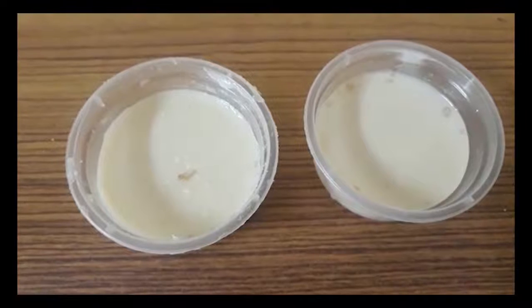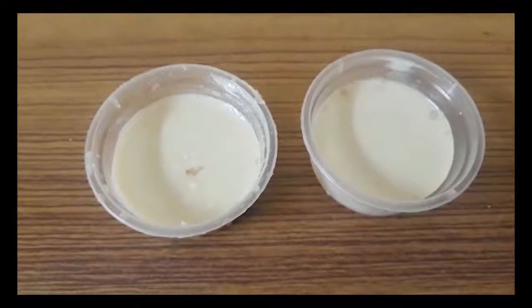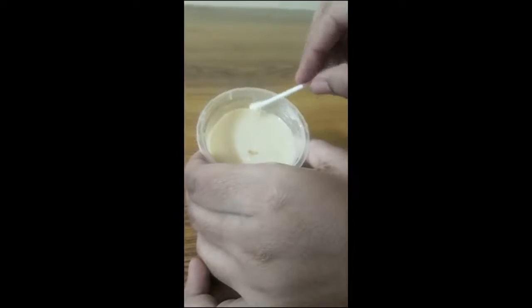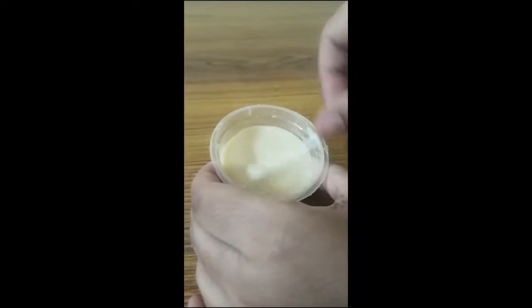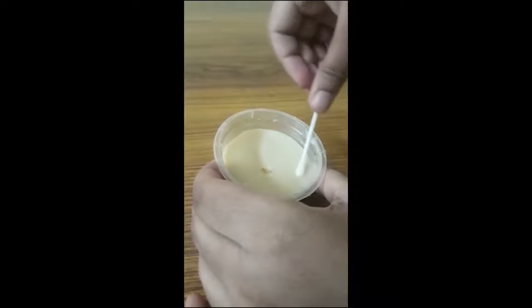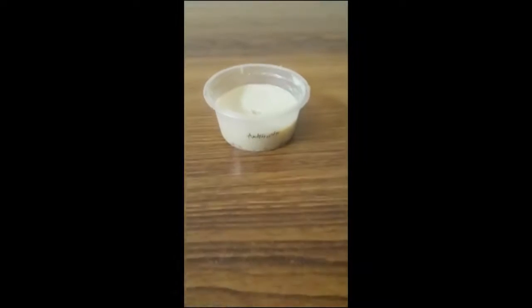After removing the containers from the refrigerator, we have to do the final step of the experiment: put the sample on the medium. For this, we will take two cotton buds, take a sample from our mouth using a mouth swab, and gently rub the sample on both of the media separately.